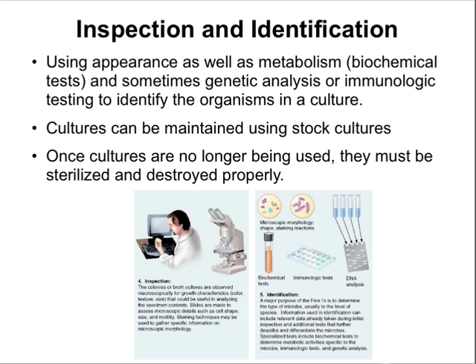In a lab situation, we would use either an autoclave, which is steam sterilization, or incineration, which is burning of it. Mostly, though, for the purposes of our labs, we'll be using bleach and alcohol sterilization, and on occasion incineration or burning of, say, an inoculation loop to sterilize it before creating a culture plate.